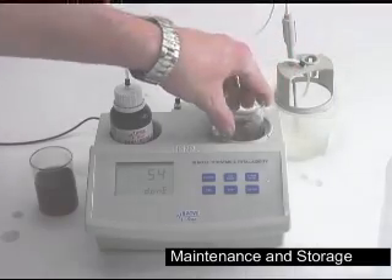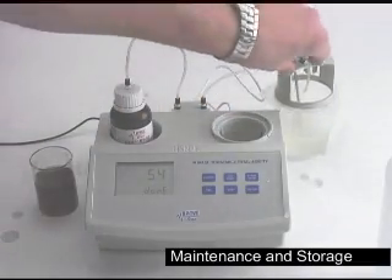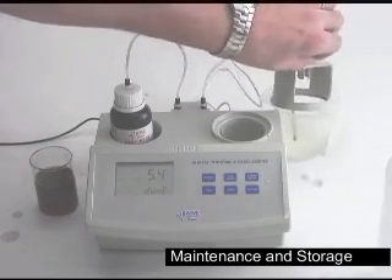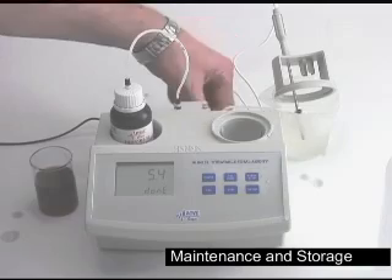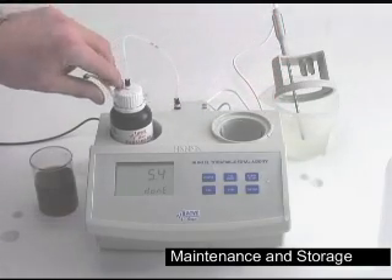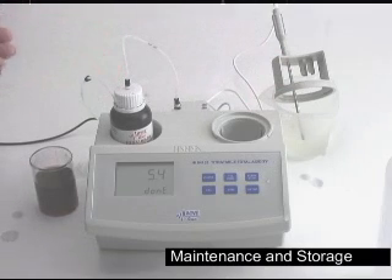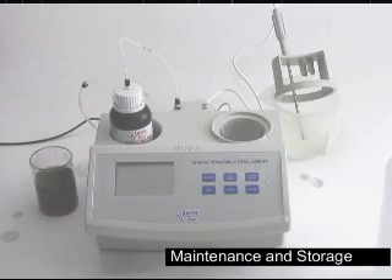You always want to make sure that you remove all your titrant and sample from your beaker. For the tubing, for the longest life possible, you want to unhook one side again holding the bottom grommet, and then simply place the tip along the side of the bottle. After you're done with that, simply turn the machine off and you're done. Thank you very much for taking the time to look at the Hanna HI84102 total acidity titrator. If you have any questions, please feel free to give us a call at any time. Thank you.